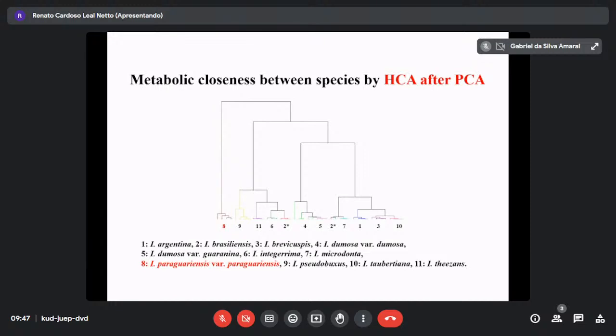Maybe I want to develop a natural decaffeinated mate. This is nice. For example, I take out the caffeine signal, and then see which one shows the best similarity to mate. Then I can claim, okay, Ilex dumosa is probably the best profile, but without caffeine. It's a sales and marketing target, something like this. Always, while you are doing this, you have to formulate your own research question.